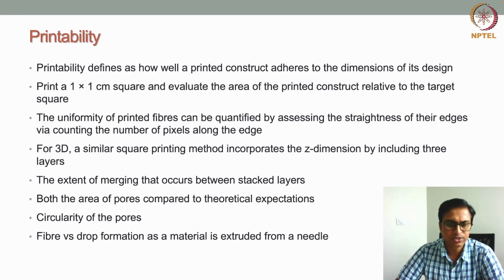Let us first start with understanding printability. What is printability? For an extrusion-based bioprinting system, printability basically defines how well a printed construct adheres to the dimensions of its design.